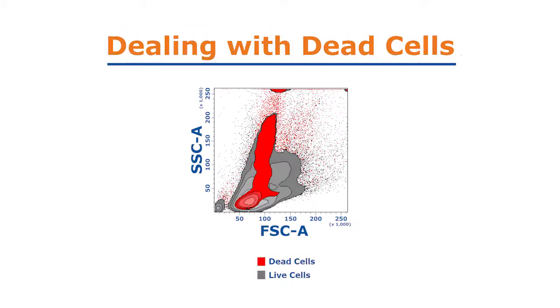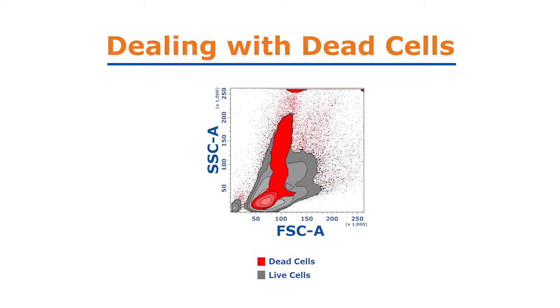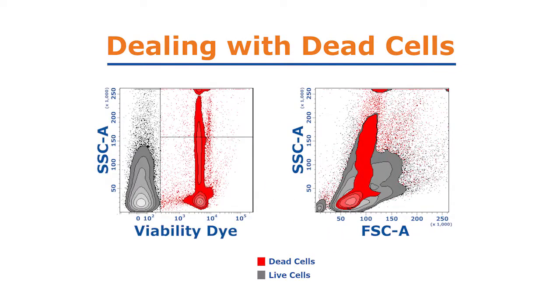Gating out dead cells can even improve your ability to gate on your population of interest. In these data showing mouse bone marrow, live leukocytes that are heavily contaminated with dead cells become easy to gate on once dead cells are removed.